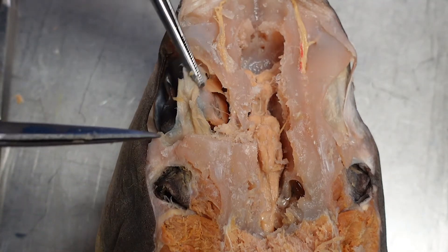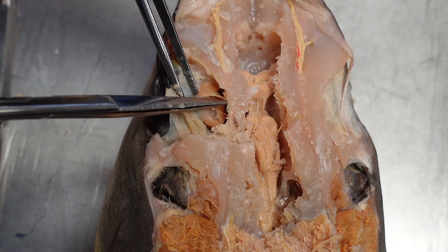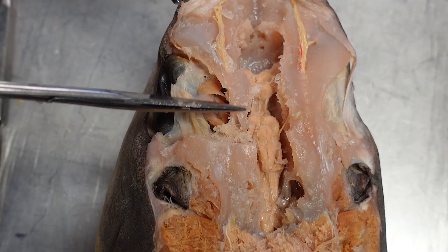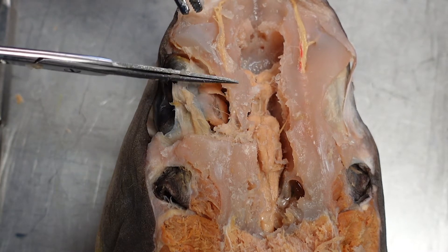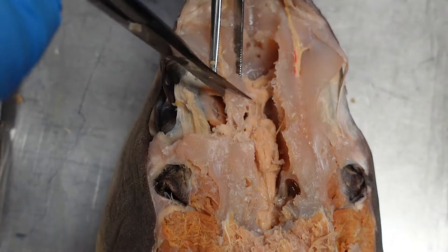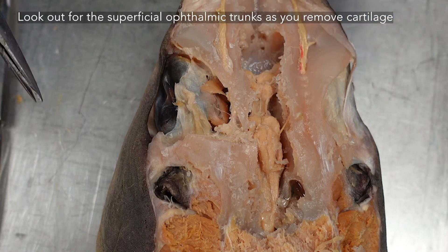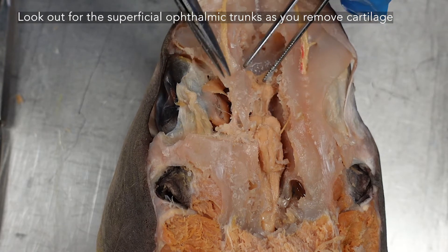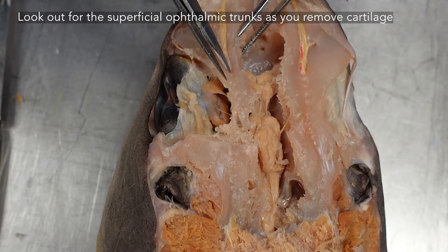As you're trying to keep the trochlear nerve intact, you can see where it emerges in the orbit through the trochlear foramen. I would recommend leaving cartilage protecting it for as long as possible — just cut on either side so you have a little bridge protecting your trochlear nerve. Also keep an eye out for your superficial ophthalmic trunk here; it descends through the cartilage. As you're cutting from the front, use that nerve as your guide so you don't accidentally sever it.